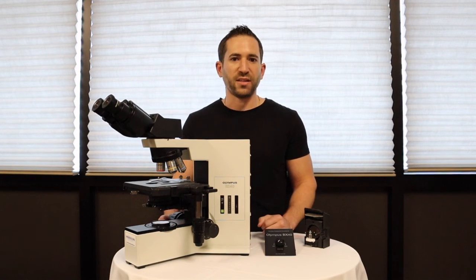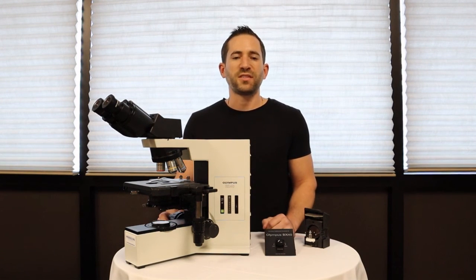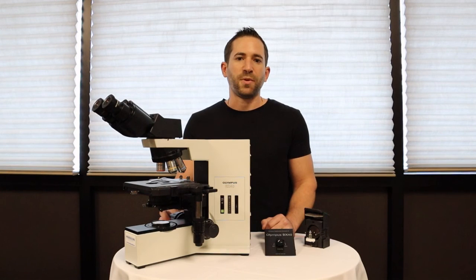This solution can be done by yourself — you can buy the upgrade and install it yourself — or you can send in the stand for us to install and ship back to you.